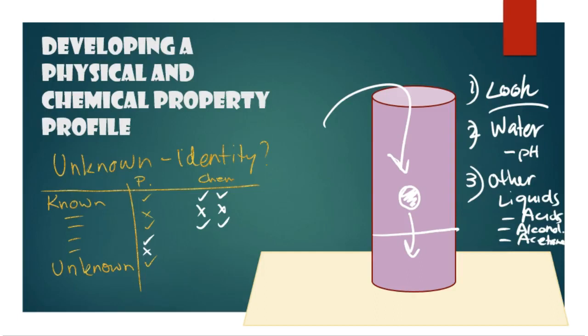Once you've done that, you should be able to see if it matches any of the known substances. So even if we don't know who's sabotaged the sugar bowl yet, we can certainly at least tell them what they ended up drinking and ended up spitting out everywhere. So that's the first piece of the puzzle.